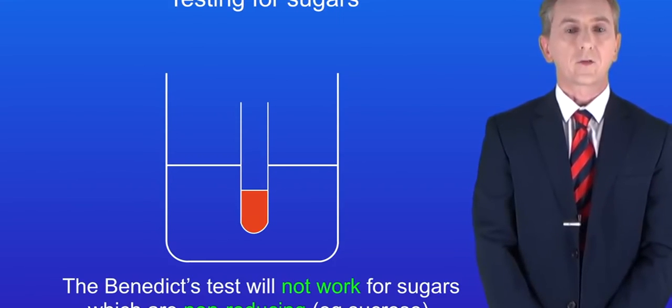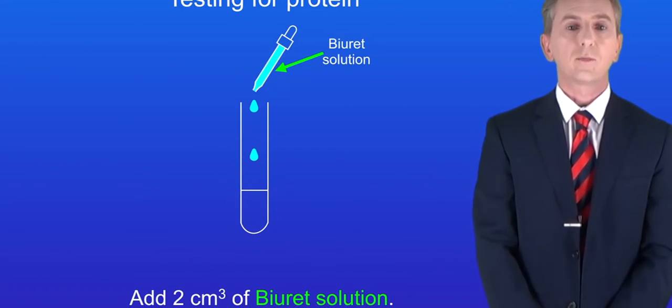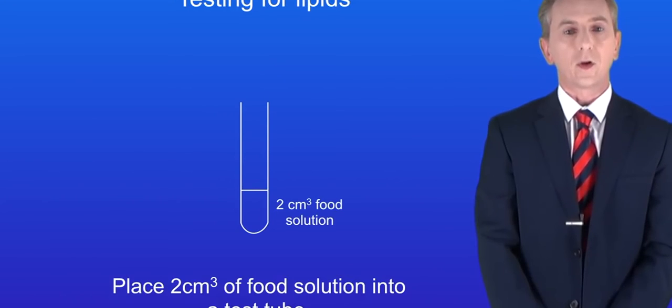Okay, let's look now at how to test for protein. We take 2 centimeters cubed of our food solution, and we add 2 centimeters cubed of Biuret solution, which is a blue colour. If our solution contains protein, then the Biuret solution will change colour from blue to a purple or pink colour. The final test we're going to look at now is for lipids.